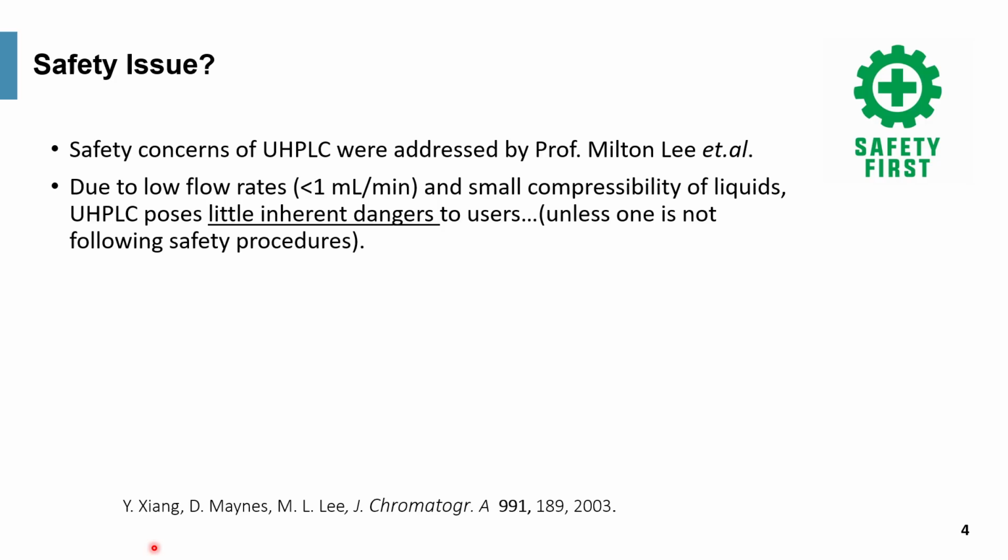Safety issue has been addressed by Professor Milton Lee. According to Professor Lee, due to the low volume of the flow rate and small compressibility of liquid, UHPLC poses little inherent danger because there's no latent potential energy being released, unless one is not following safety procedures such as disconnecting the inlet pressure under very high pressure without safety glasses, etc.